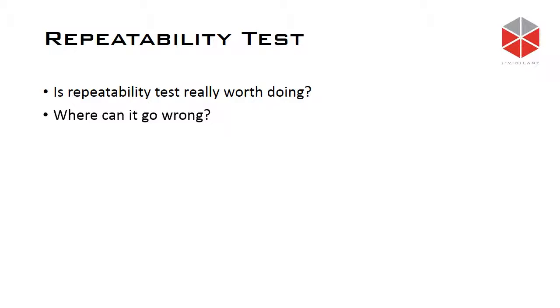First, if we use the wrong procedure, it leads to a false impression. Here's an example. People start using the unnormalized value to compare against the certified standard. When the unnormalized total is high, it will give us quite a high reading. If the unnormalized total is low, it will give us quite a low reading. And sometimes the repeatability test fails because of that. It basically leads to a false impression that the GC isn't working properly, that it's not repeatable enough.